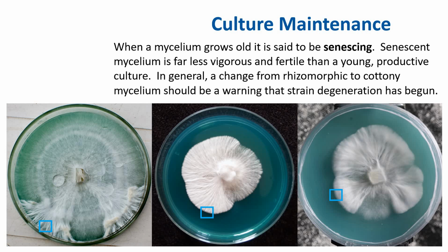So you use what you need from a culture and then return the rest to storage. So if you have a stock culture, you want to take a little piece out and then propagate that and use that. And once that mutates, you go back into your culture collection and start from there, right? The culture collection in the refrigerator kind of slows down the growth, so the fungi is in that state where it's kind of resting and young. So when your culture outside gets old, you can always go back into your culture collection and revive that culture. Cultures that have been grown continuously for several years will sooner or later develop substrains that don't resemble the original colony. So if all effort fails, re-isolate a new strain from multi-spore germination.